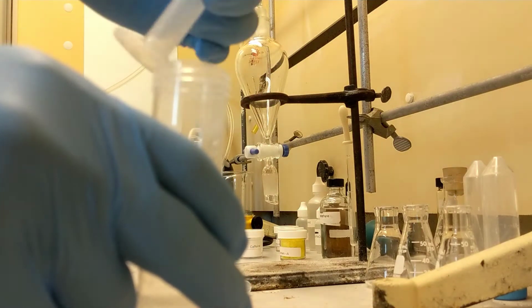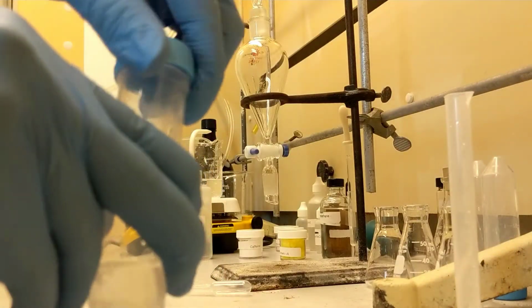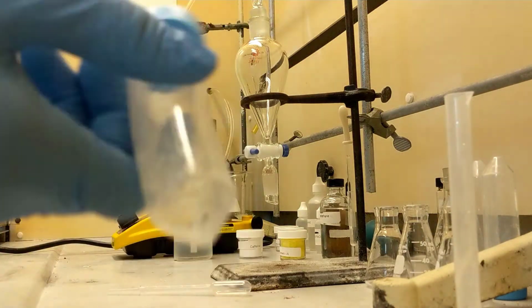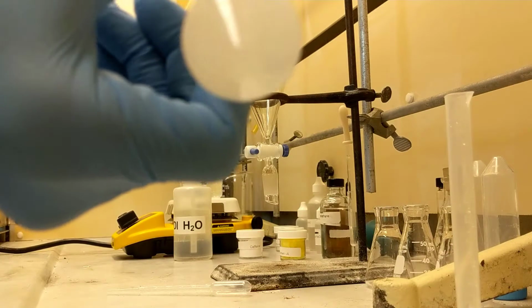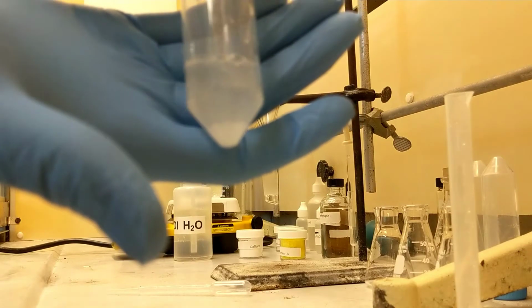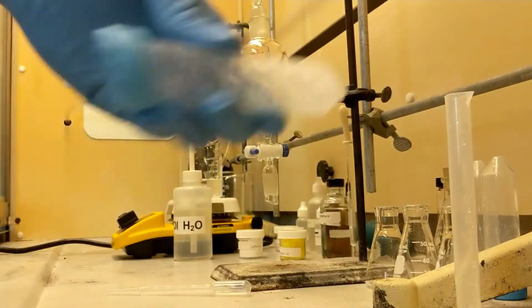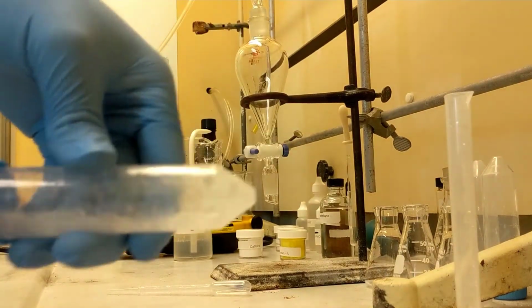Once that's been added, I'm just going to make sure I got all of it. I'm going to shake this vigorously for a couple seconds, trying to get the caffeine to dissolve completely. As you can see, the caffeine does not want to dissolve. You can see how cloudy it is. You can probably see the particulates still floating around. So I'm going to shake this for a couple minutes vigorously, and I'll see you guys when I get back.